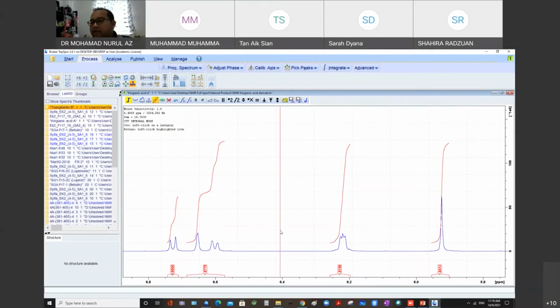If you remember, when you were in undergraduate, you had to measure the height of the NMR integrals, and after that divide with the smaller integral, and you can get all the protons. This is the idea. But if you are doing higher postgraduate studies, the system will do it for you. So I just trim the spectrum.